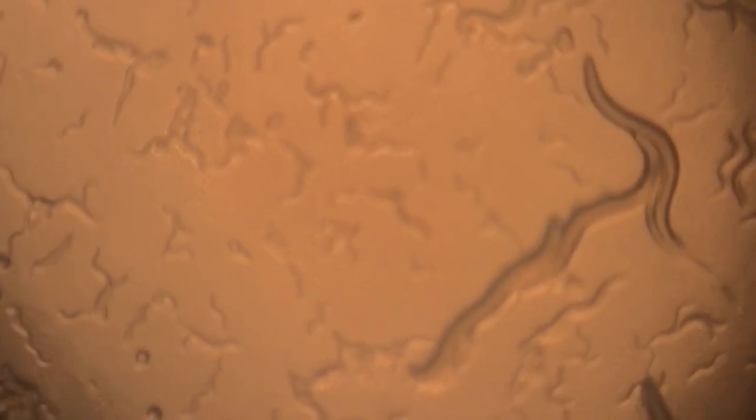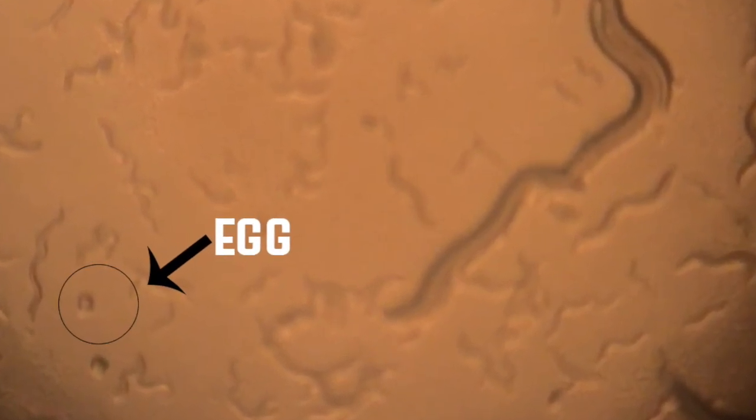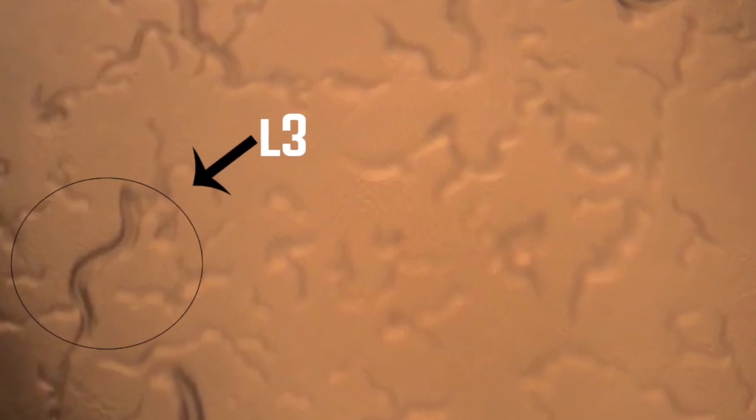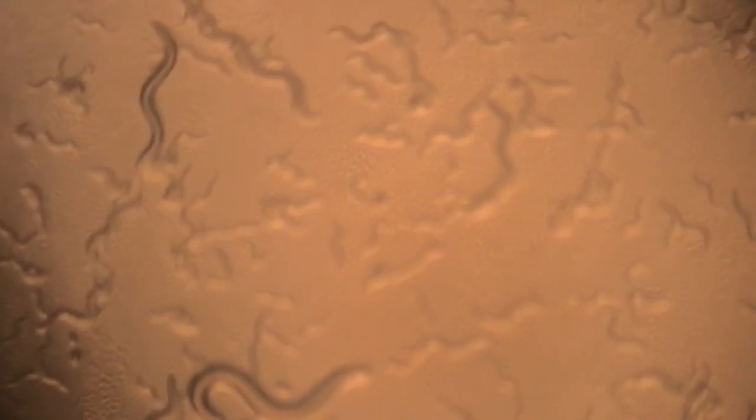These new plates contained ampicillin to kill off all of the bad bacteria and IPTG, which makes the bacteria reproduce. Once in the other petri plate, we bleached the worms again with 1 drop of bleach to kill the remaining adults and sealed the petri plates with parafilm to contain the life inside.